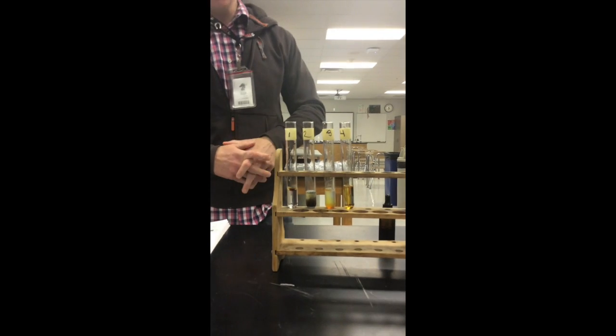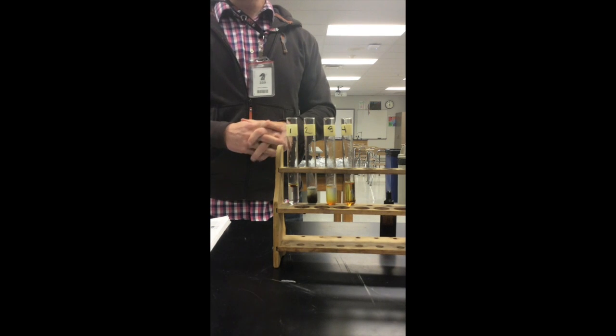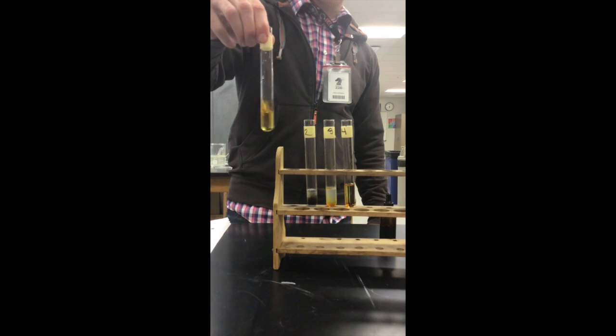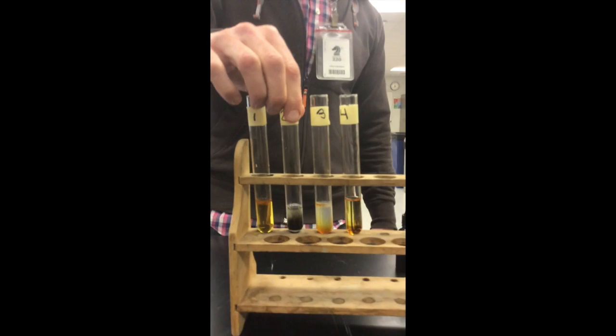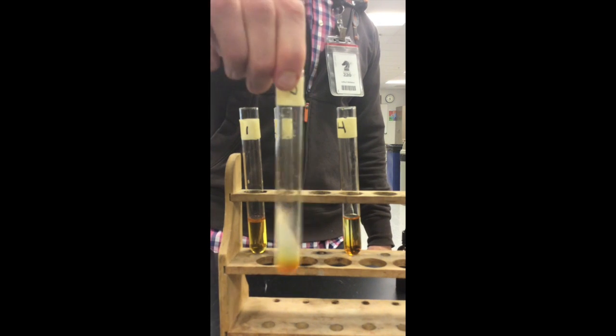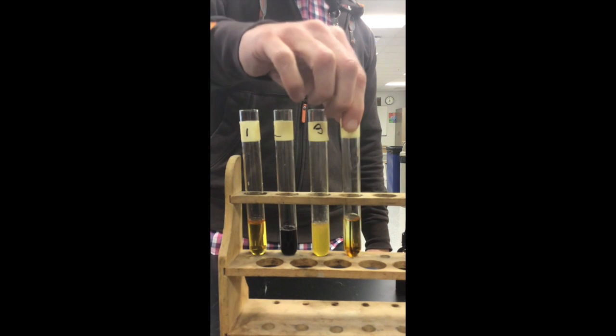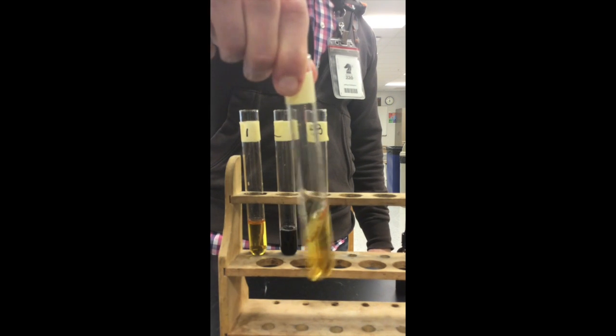If there's a color change from yellow to blue or dark purple, then we know that there are starches present. So we're sitting around here. I'm going to let that mix a little bit. Looks still like a yellowish orange to me. Ooh, looks like we have a positive there for unknown number 2. We'll come back to that, but tentatively that might have some carbohydrate starches in it. Unknown number 3 still looks a little bit yellowish orange to me, as does unknown number 4.